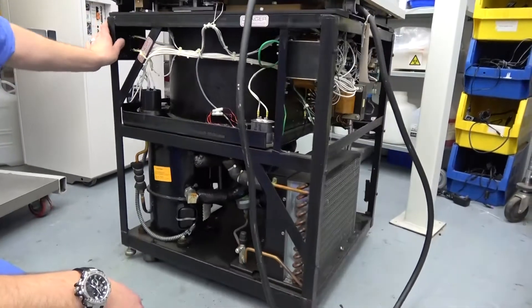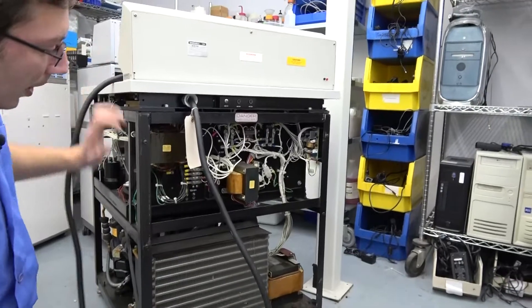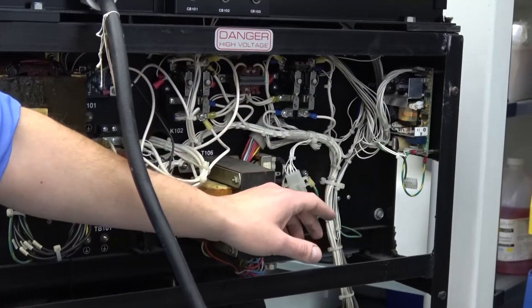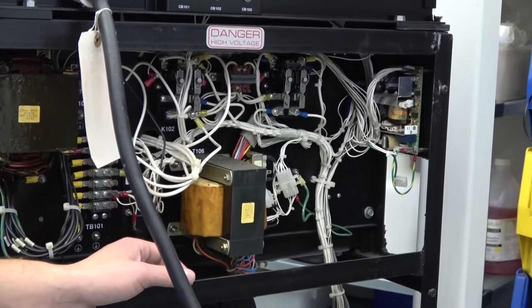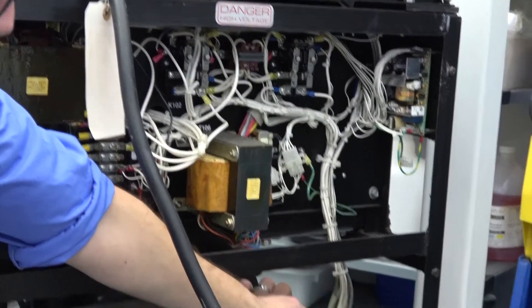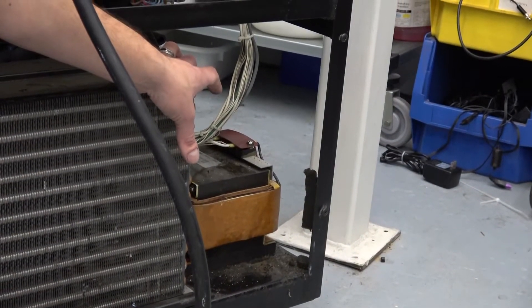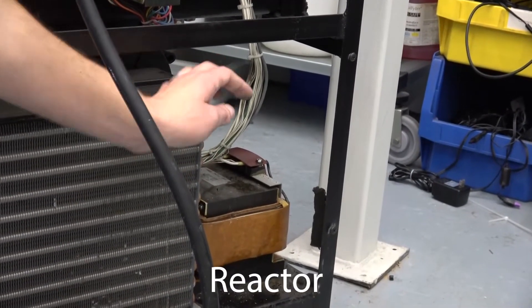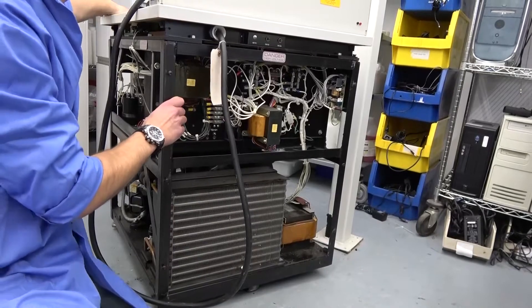If we rotate to the back, where all the fun is — several transformers for different voltages. You've got your power supply, run relays, compressor relays, and slow relays, as well as another transformer that at this moment I could not tell you what it does. You do have this transformer down here that does most of your transforming of your main voltage, and also for your motor.